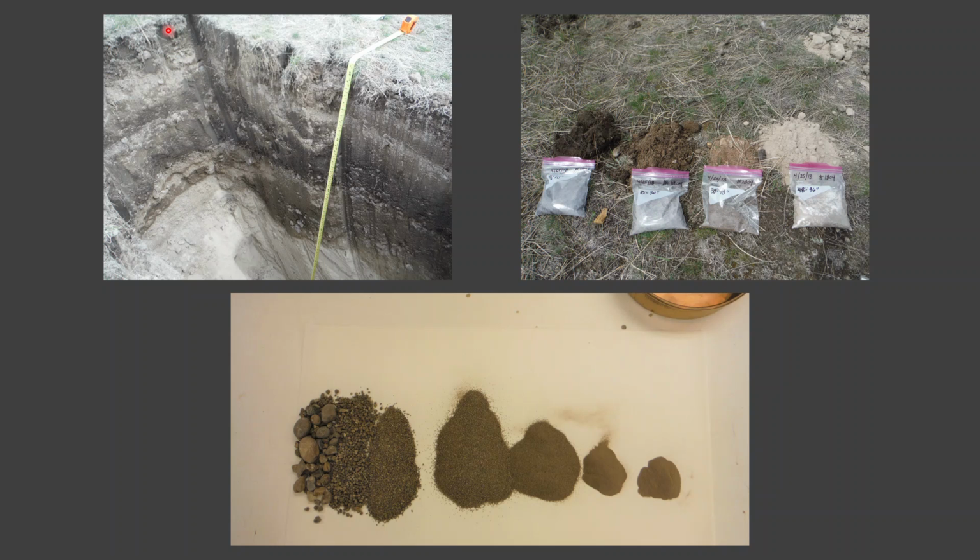You can see this first 10 inches is a loamy topsoil. I saw a different texture here in the next 20 inches, 10 to 30. There's an intermediate accumulation B horizon of clay down there. And then below that, I think this is our bucket number 7 that we're working with in our lab here. It's that pure silt.